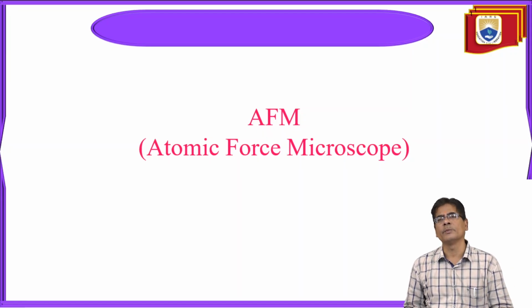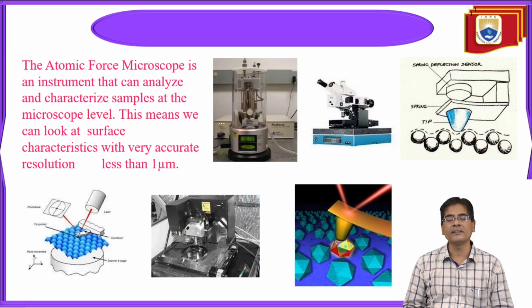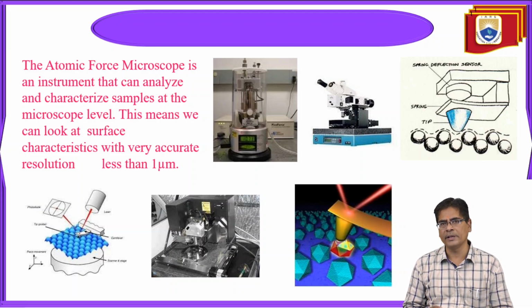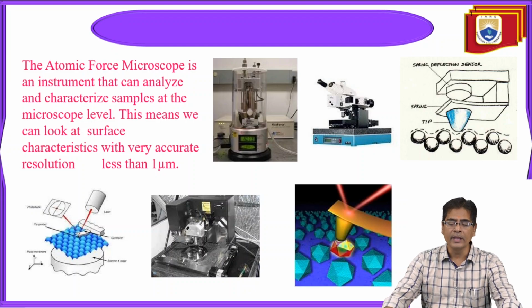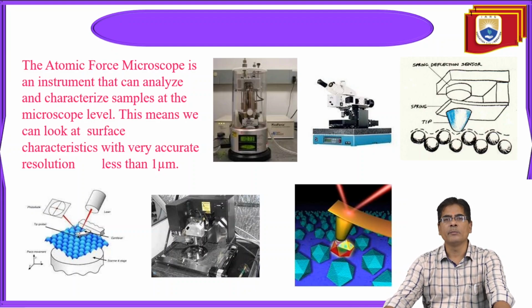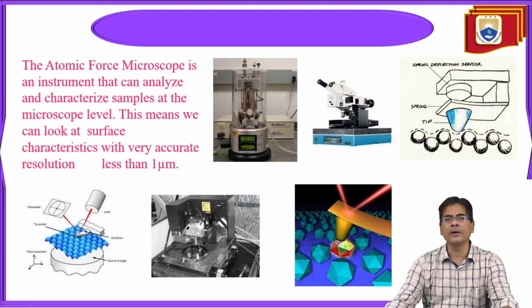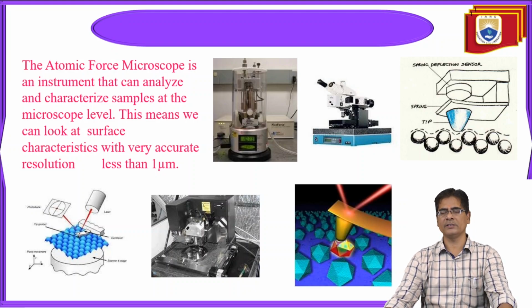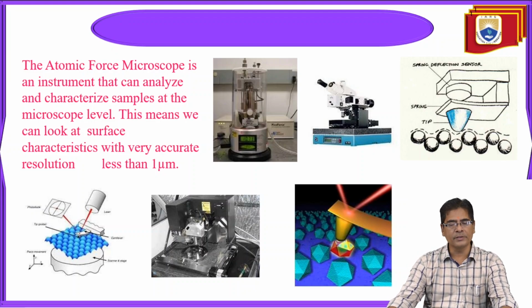So what is atomic force microscopy? Atomic force microscopy is an instrument that can analyze and characterize samples at the microscopic level.